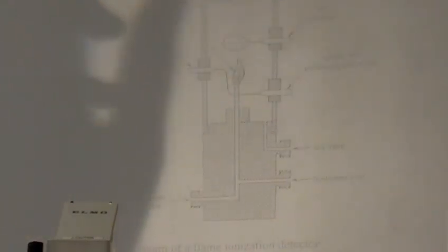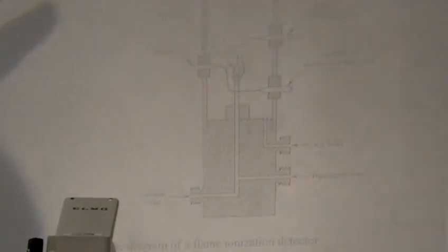What is detected is those ions. You're detecting current from those ions coming off of the detector, and you're detecting how much and also when it comes off the column. This makes it a really sensitive detector.